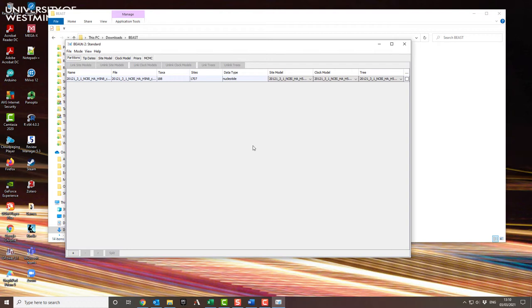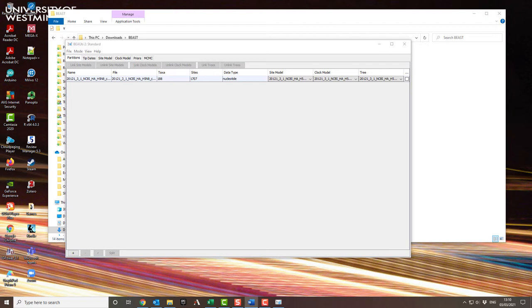You can have more than one sequence alignment if you want to do several different genetic regions that you think might be linked to one another, but that's more complex than we're doing here. Next thing after doing that, I need to work out the dates of my sequences, and those are called the tip dates.